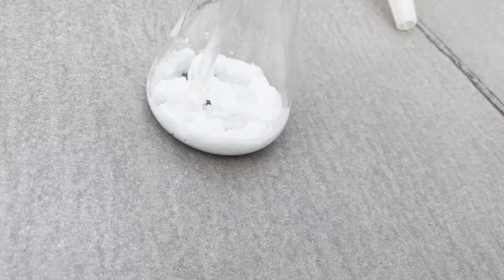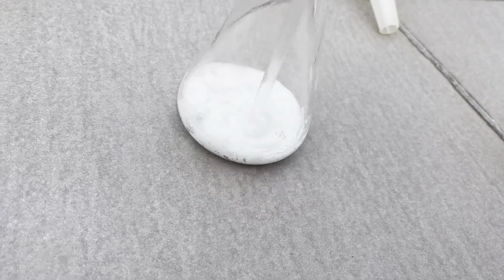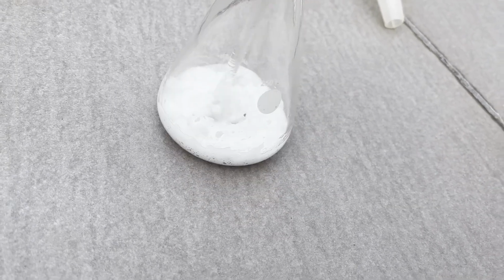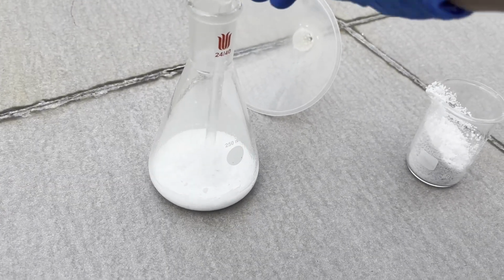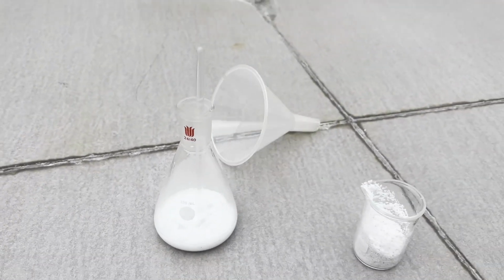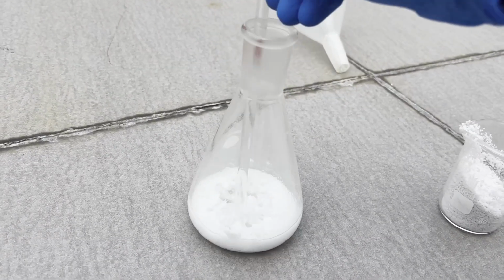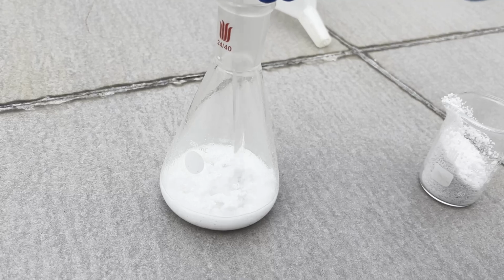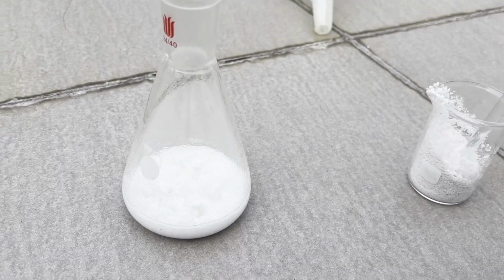When this happens, adequate mixing with a glass rod is necessary to prevent sudden runaway reaction when a lot of potassium hydroxide contacts the hydrazine sulfate at once, which is what is happening here. I didn't realize that the reaction is so exothermic, and some hydrazine vapor is released from the flask, which, needless to say, is very dangerous. I'm wearing a respirator and gloves at all times during this procedure, so fortunately I didn't smell any hydrazine.